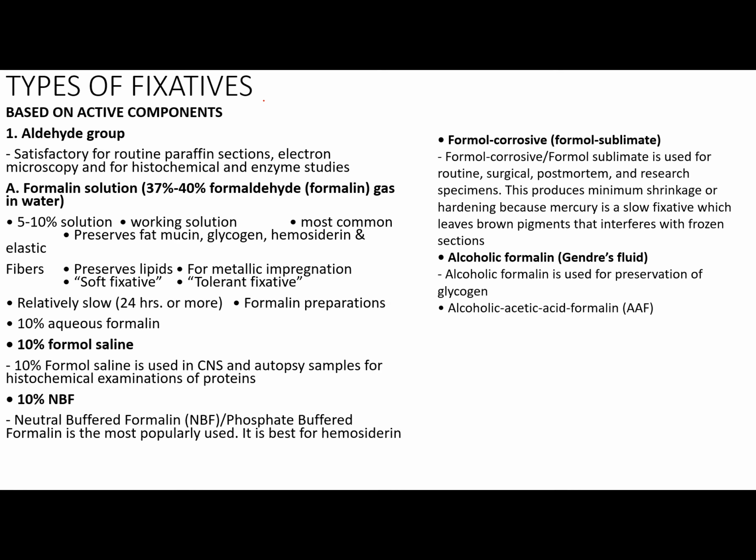Now, 5 to 10% solution ang ideal formalin nyo. It should always be 5 to 10% formalin solution. It is considered the working solution. It is the most common fixative. Now, 5 to 10% formalin is known to preserve fat, mucin, glycogen, hemosiderin, and elastic fibers.